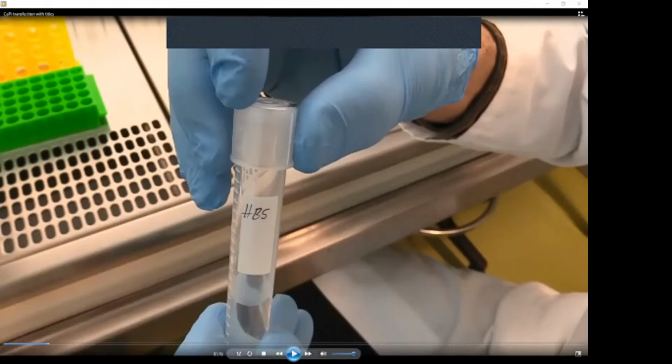Notice this information because it is necessary for the explanation of our results. What you see is one of the reagents necessary for the calcium phosphate transfection, the HEPES buffered saline solution. The protocol for this solution is easy to find, and it's necessary just to have the optimal pH. This is very important when you do it yourself. It has to be tested because it affects the efficiency very strongly.